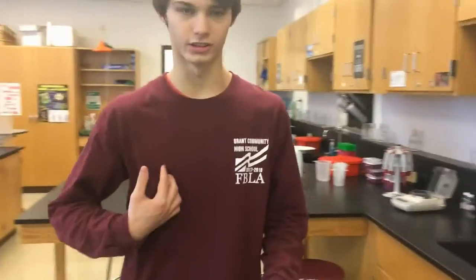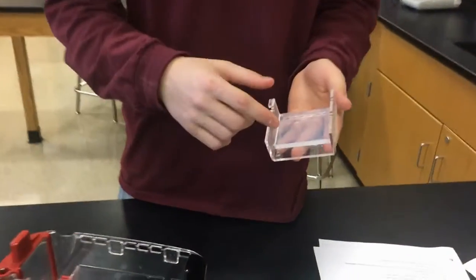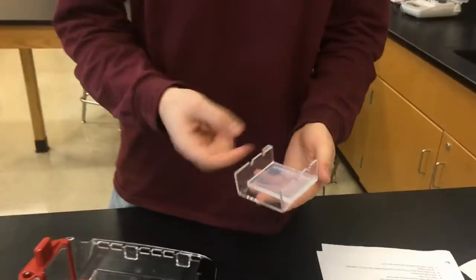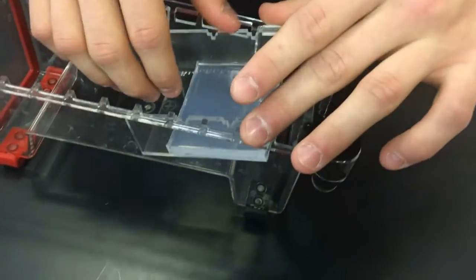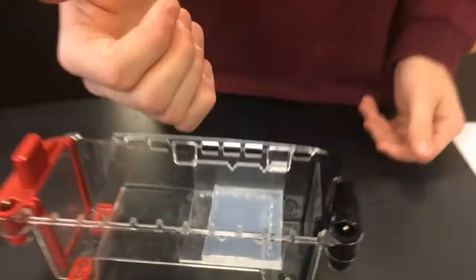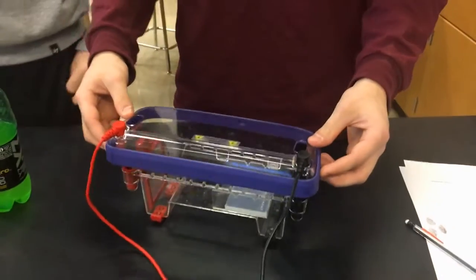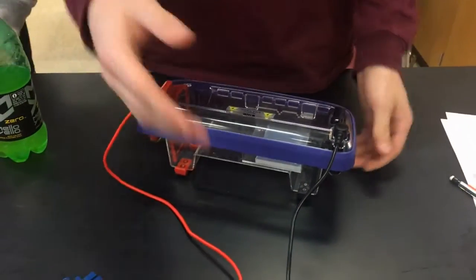Alright, for right now I'm going to show you how we run our restriction enzymes. You take your pre-made agarose gel and you put it in the chamber, keeping the negative side on the top. You're going to insert it into your electrophoresis chamber and load your DNA inside of it. And then you're going to put this on top and plug these in.